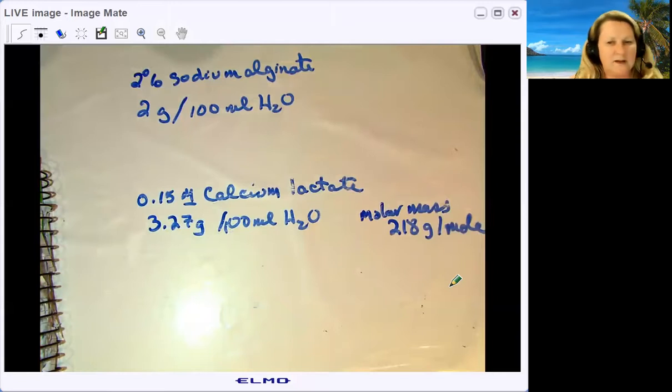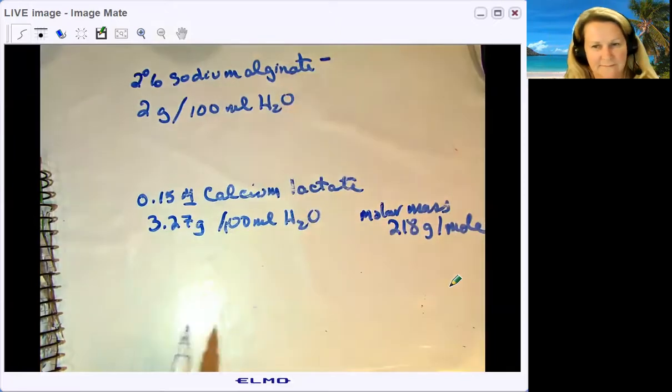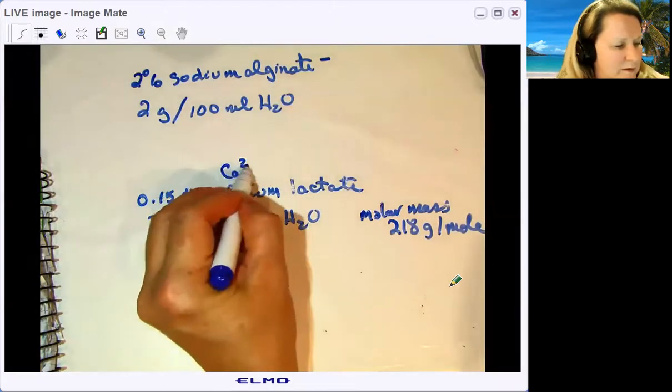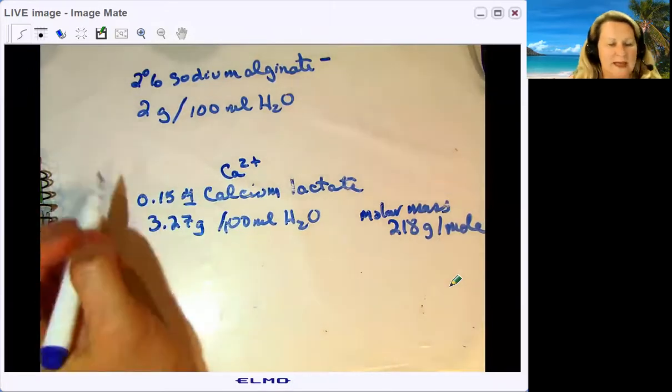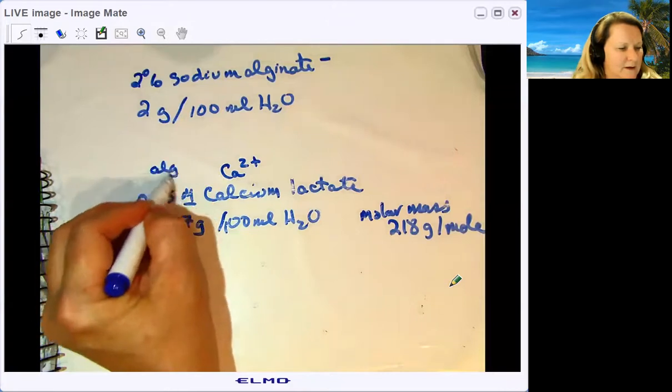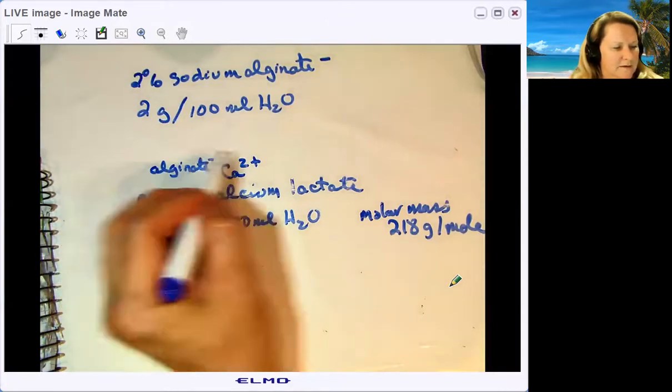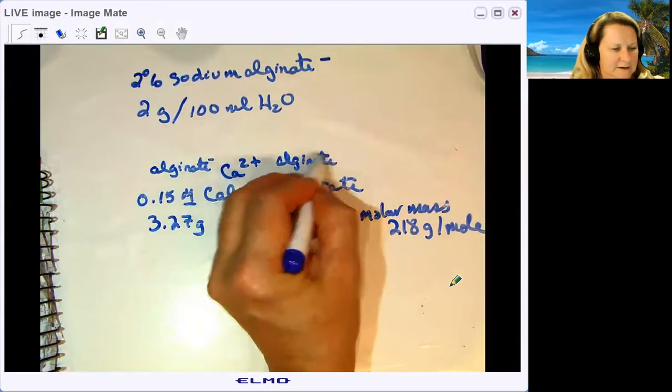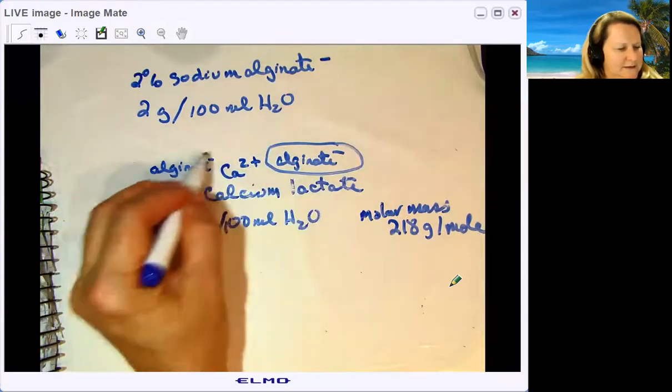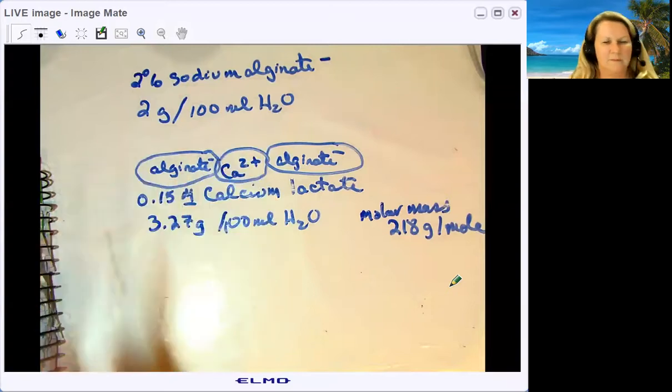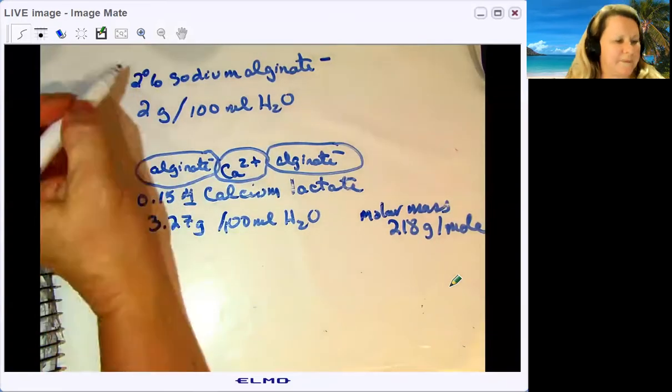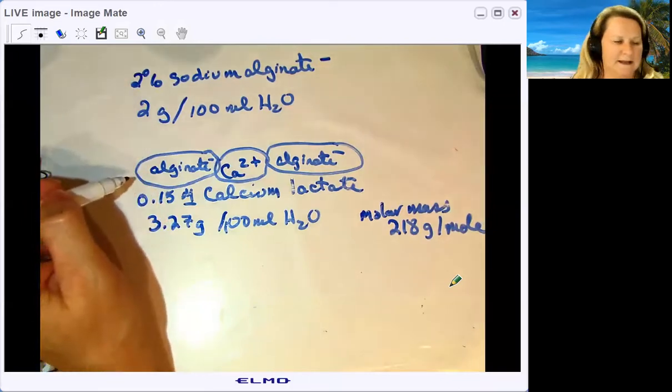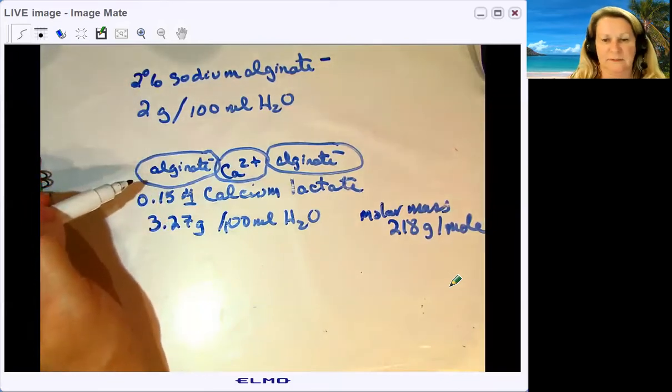What the sodium alginate and calcium lactate are going to do: Alginate is a negative ion. The calcium lactate in water dissociates and produces calcium ions. Every calcium ion will bond with two alginate ions. It's not exactly a polymerization reaction, but this is what causes the spheres to form. When you drop the alginate into the calcium lactate, you'll see it start to polymerize.